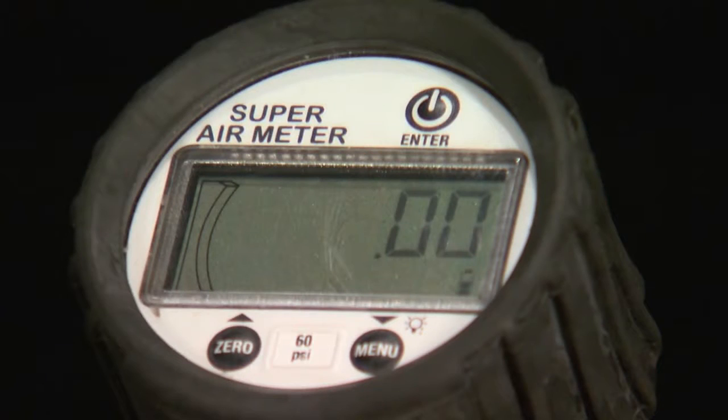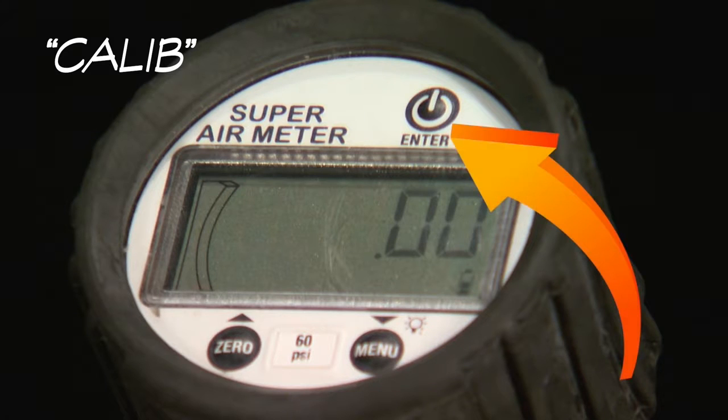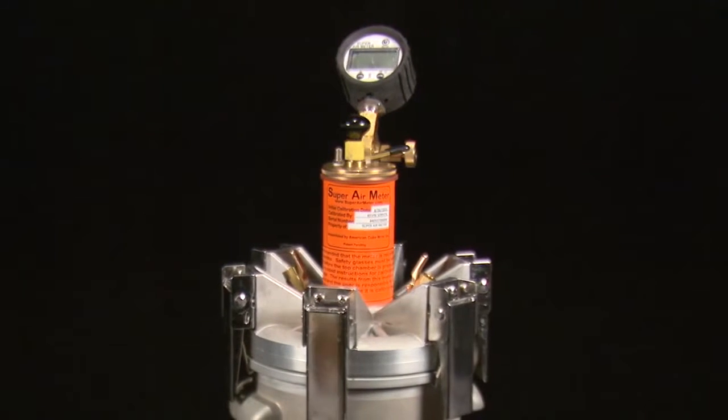Hold the menu button until the text line is flashing. Use the bottom two buttons to navigate until the calibration option is flashing in the text line of the gauge. Press the enter button and start will be flashing in the text line. Press the enter button two more times to begin the calibration and display the first set of test directions.